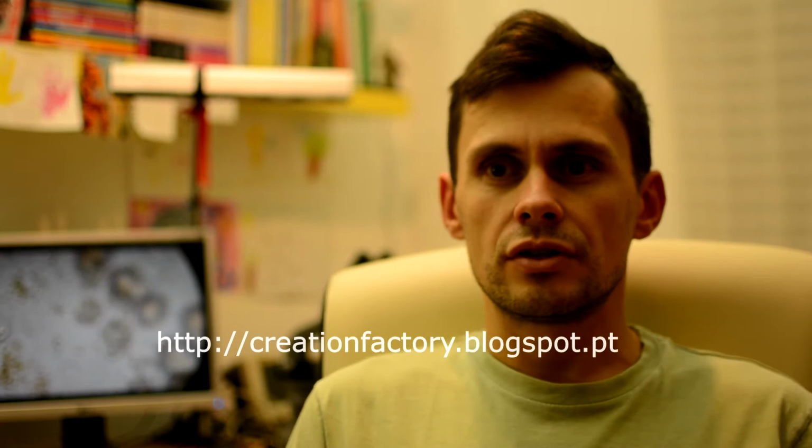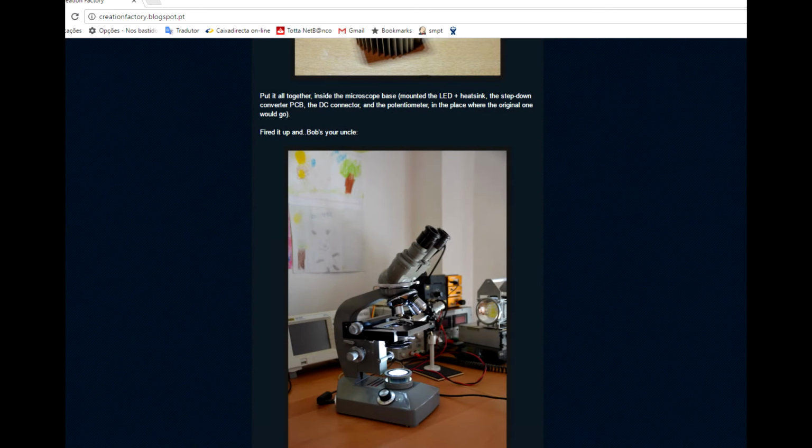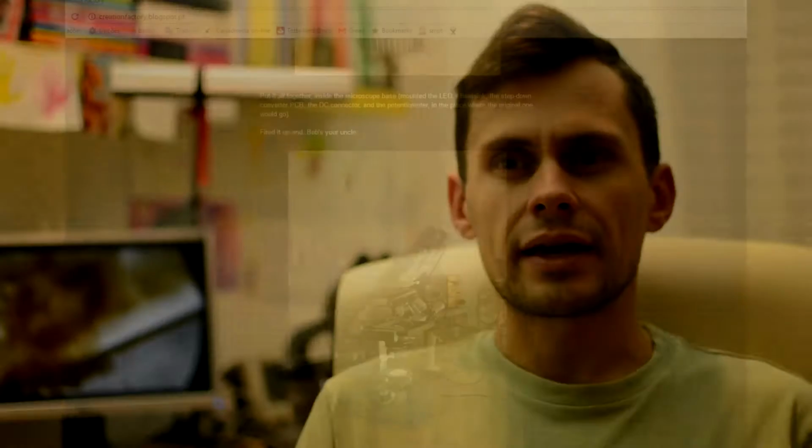As you may have had a chance of taking a look at under my blog at creationfactory.blogspot.pt, I have recently scored from eBay a 50-year-old Olympus microscope, which in spite of my modest expectations, I found to be in pristine condition. Since the moment I unpacked it, I have been doing several experiments and observations into the microbial world.